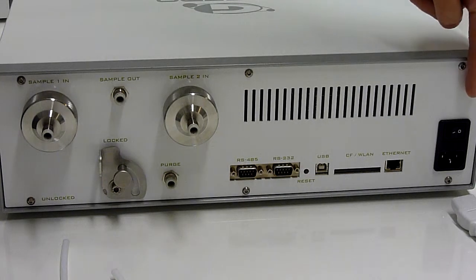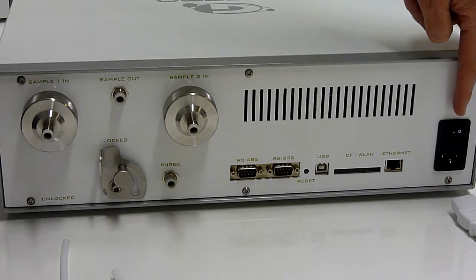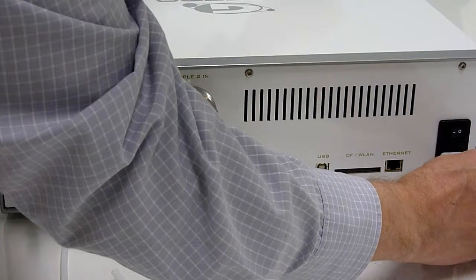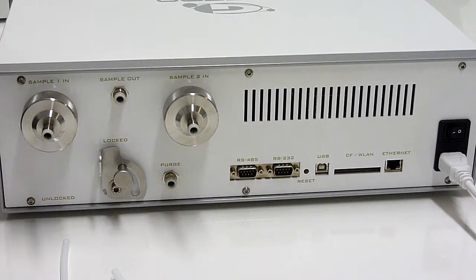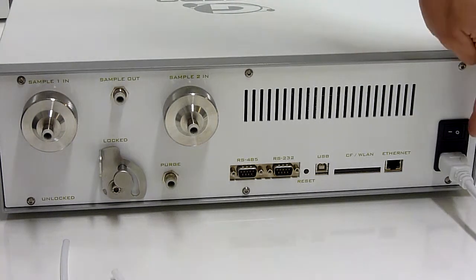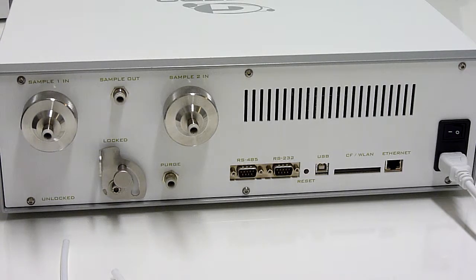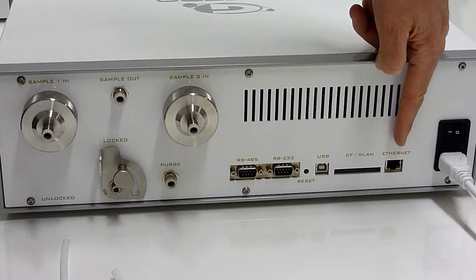On the right you can see the mains connector for the power cord, mains power switch, and fuse holder. Over here is the connector for the Ethernet.